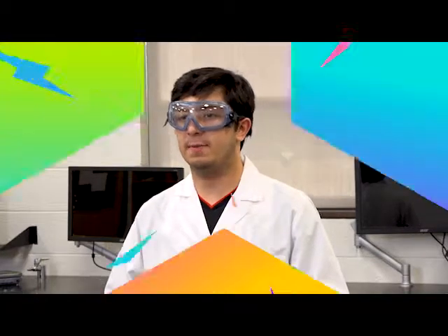Before starting the experiment, make sure that you put on your goggles, your gloves, your lab coat, wear closed-toe shoes, make sure that your pants cover your ankles, and if you have long hair, please tie it back.